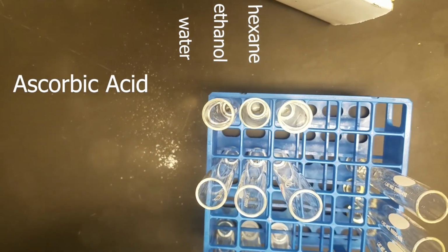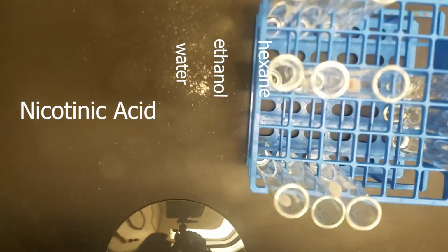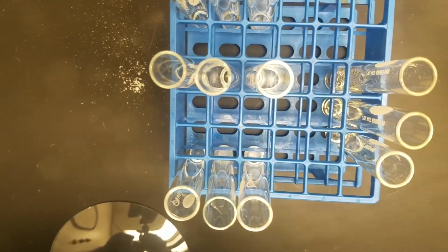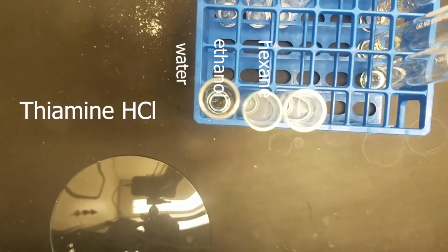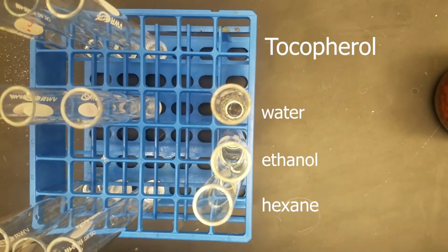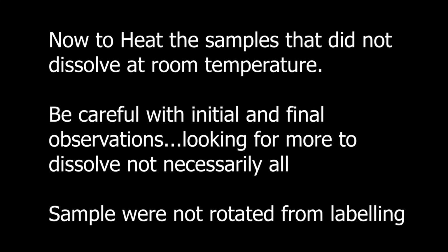This next part's going to go kind of fast, but we'll get an aerial view of each of our solutions with some labeling to help kind of identify it. So what you should be doing is looking down those. We've got the white or the black background to help kind of show that. So you can see if there's white powder down there. And then for the tocopherol, these are impossible to see, but it's at least another observation.